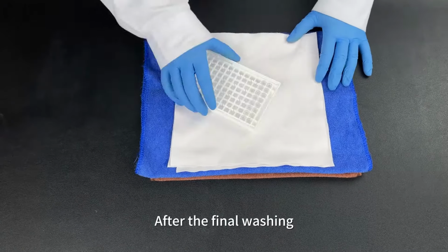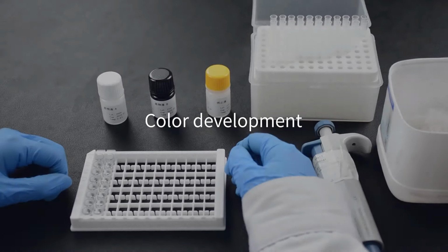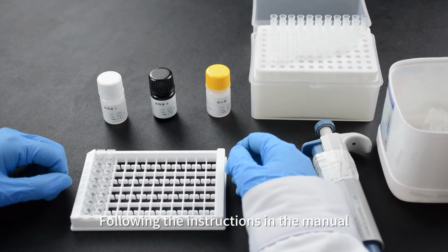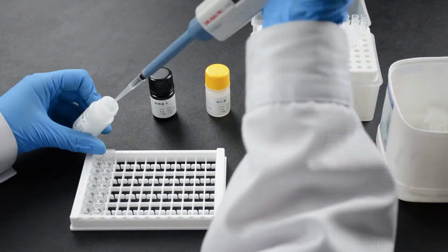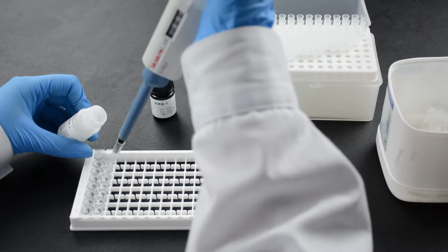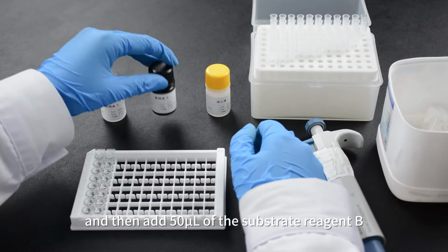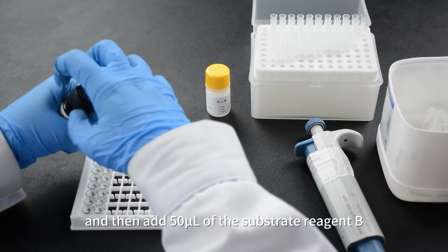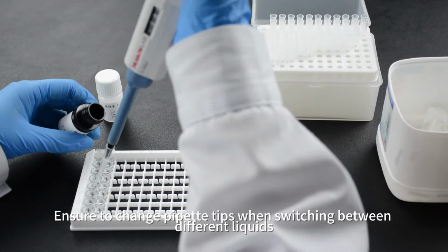After the final washing, pat dry with an absorbent paper. Color development. Following the instructions in the manual, first add 50 microliters of the substrate reagent A. And then add 50 microliters of the substrate reagent B. Ensure to change pipette tips when switching between different liquids.